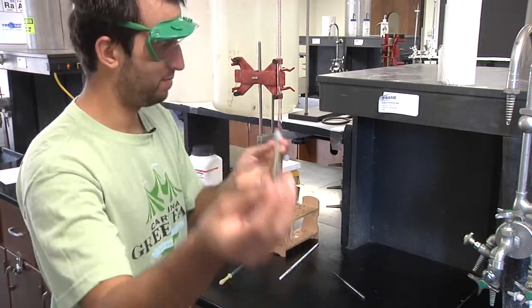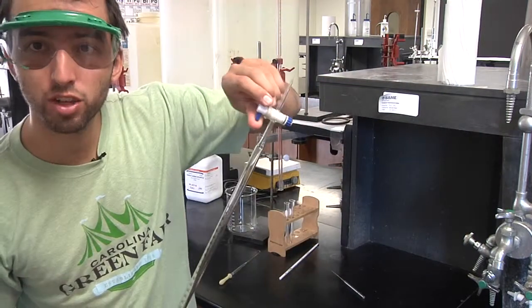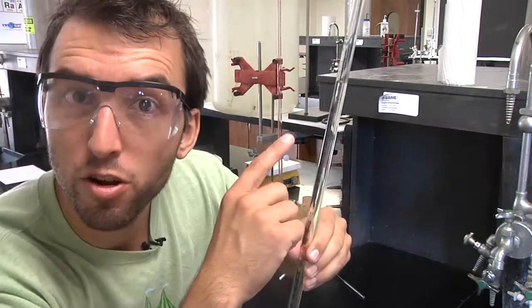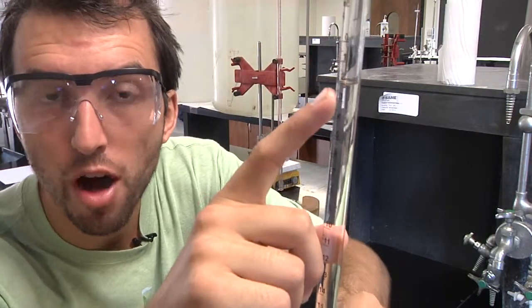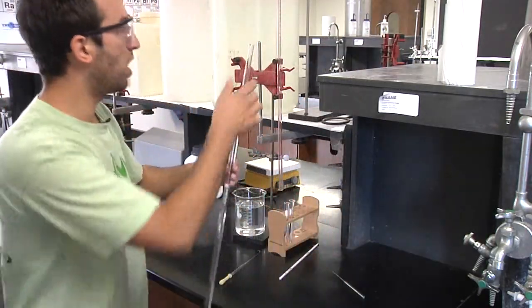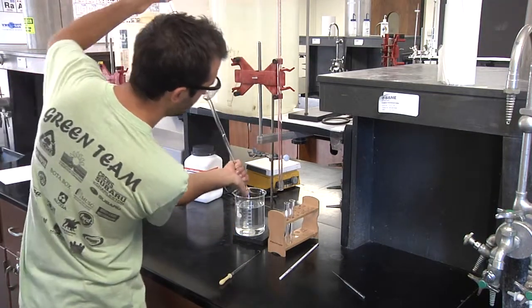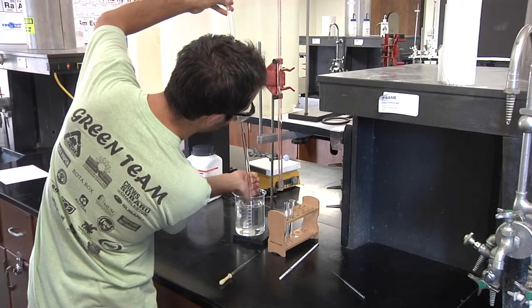Take your burette, make sure it's closed, and fill it with water. Now that your burette is filled with water, you want to put your thumb over it and invert it into your beaker.